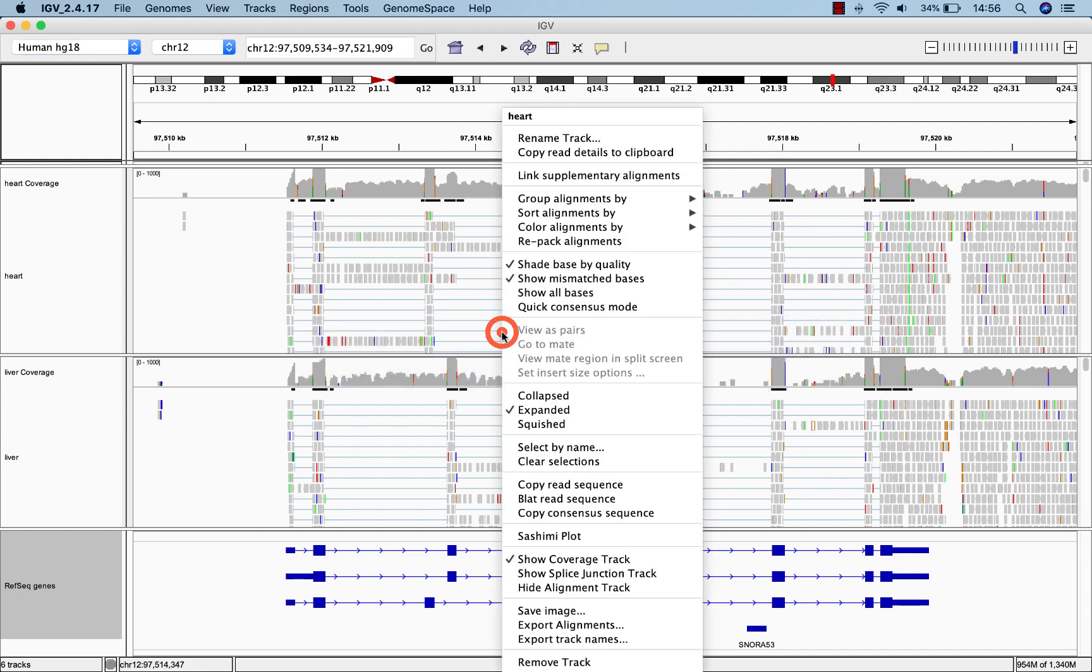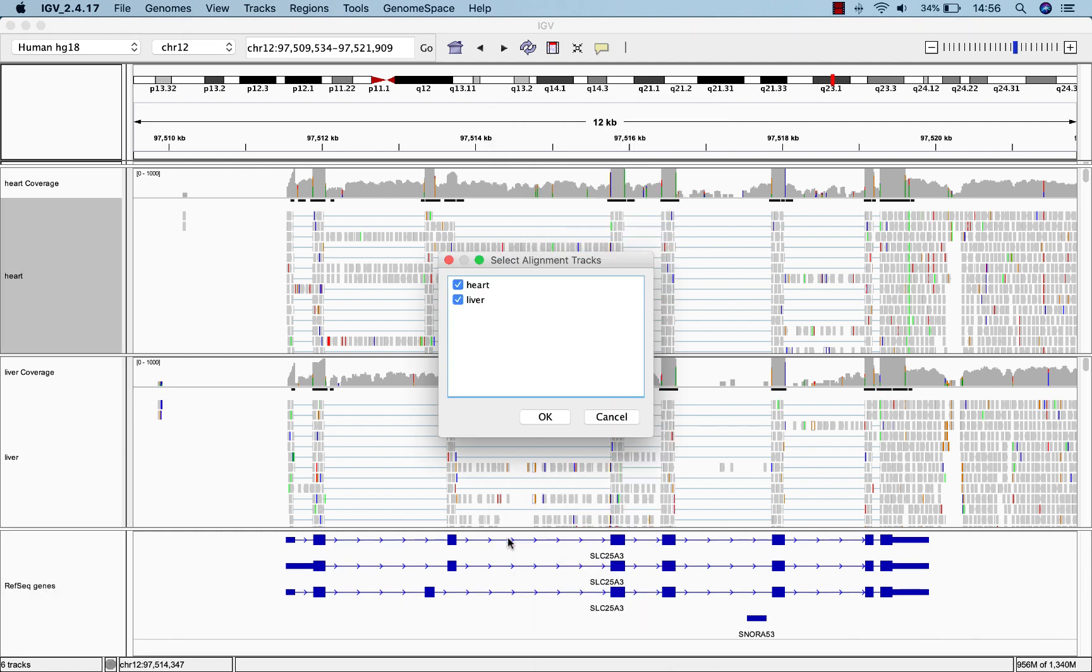To open a sashimi plot, right-click and select sashimi plot. Select the data tracks you'd like to include and click OK.